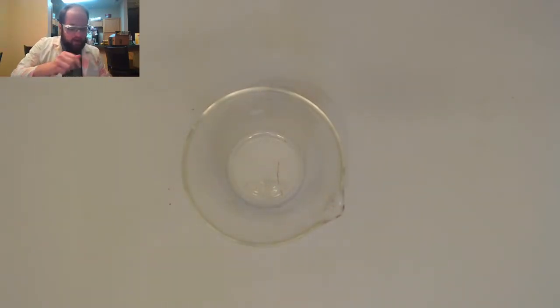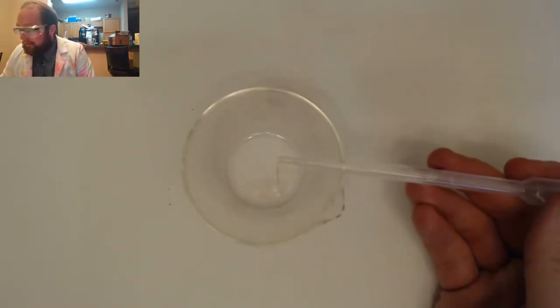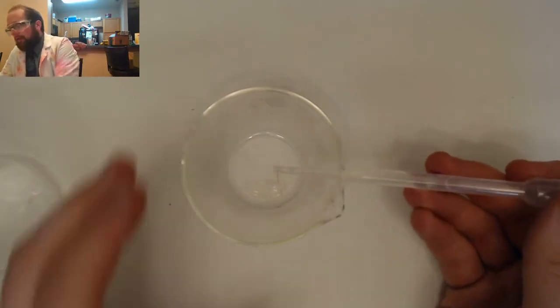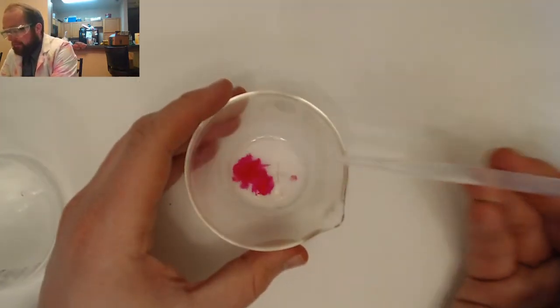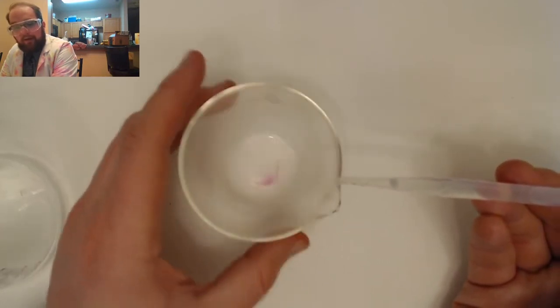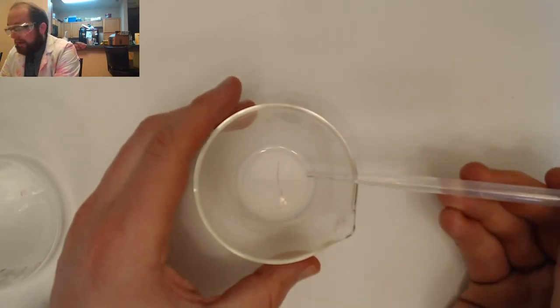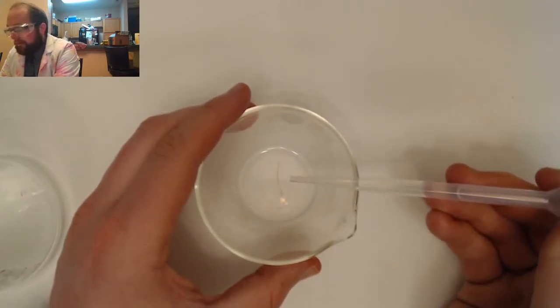But let's start to add some base. Okay, we know that when acids and bases react, they create a water and a salt. Very good. Okay, and take a look at this. When they react, you can see that boop, that pink is a sign that that base is happening there. Oh, but look, when I swirl it, it goes away. That means the base has gone away. That's because the acid and the base are reacting.